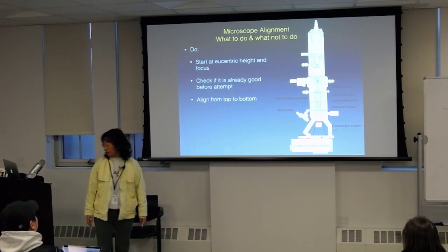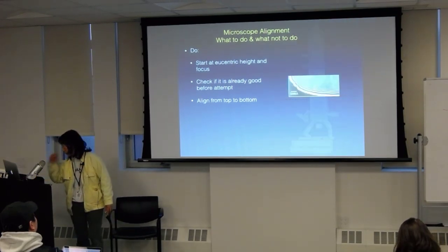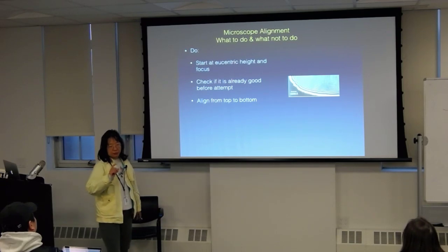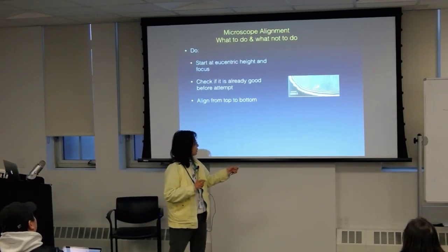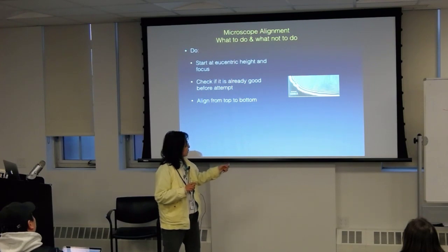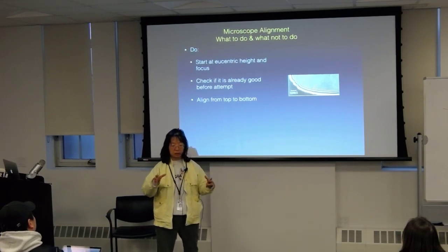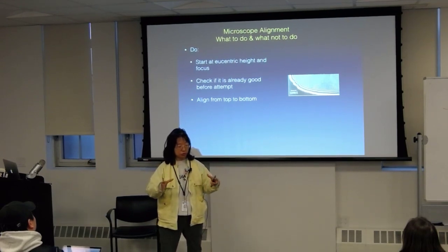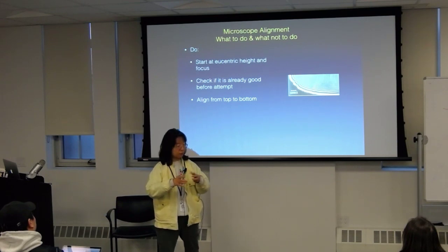Now for the condensing system, there's something that you would look for. Your beam is going to look something like this on the edge. So this is the edge of a beam, and you're going to see a lot of ripples here. That comes from this electron source being very coherent, and the fact that the condenser aperture is not at the same plane as where it focused.